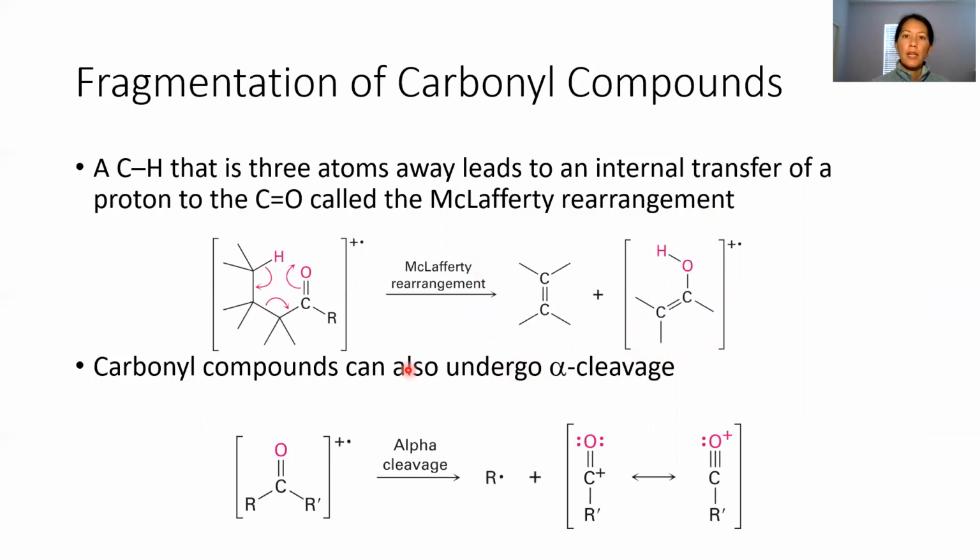So again, carbonyl compounds, if you have a hydrogen here, you can fragment here, and what you would observe is this fragmentation with a hydrogen added.